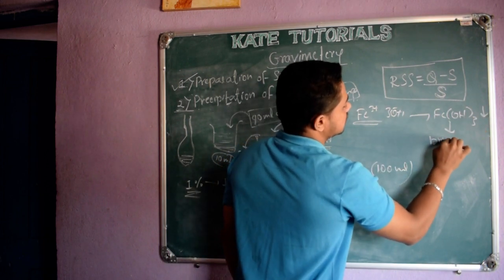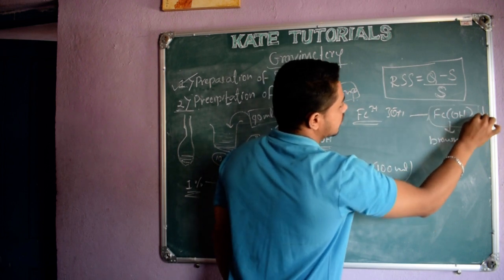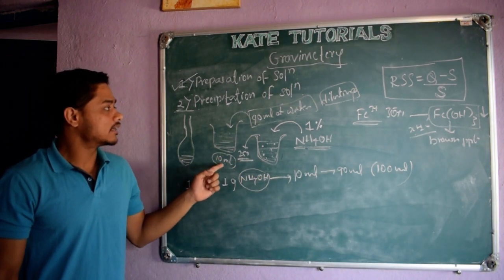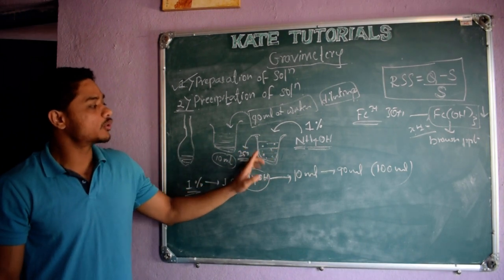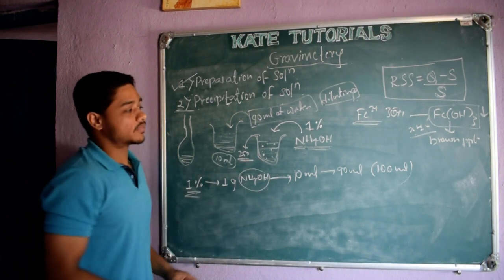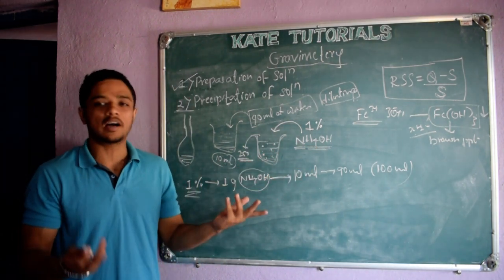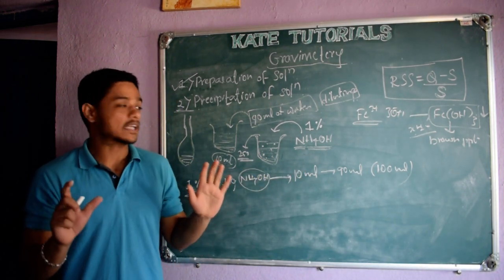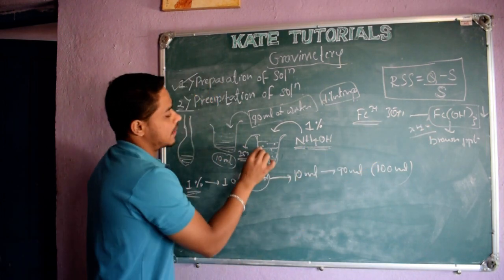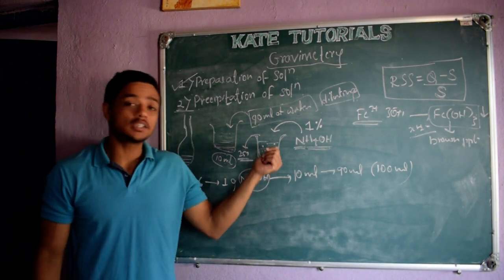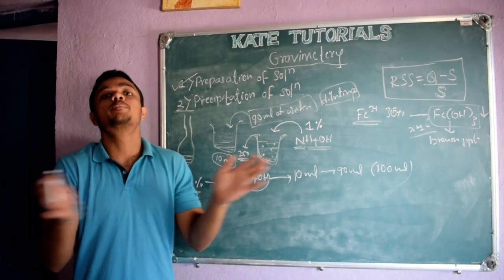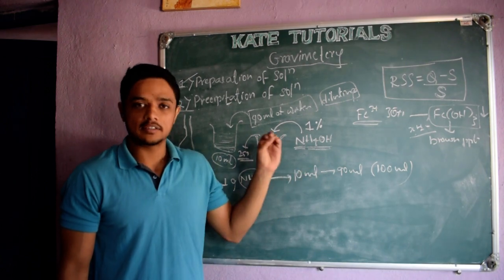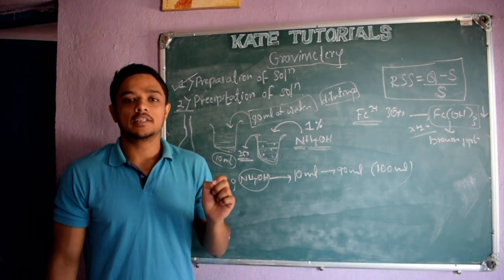And the color will be brown — the brown precipitate we will get. The precipitate is Fe(OH)₃·xH₂O. Its composition is not known exactly. So, I took the analyte, I diluted it — so that analyte should be distributed throughout the solution. If analyte is present only at the bottom and I add 1% ammonium hydroxide, it may precipitate haphazardly. But in this dilute solution, if I add dilute ammonium hydroxide, the precipitation will occur selectively — only Fe3+ will precipitate as Fe(OH)₃, and other molecules won't precipitate. If the solution is concentrated, then precipitation will be very fast, and some errors may occur. Here, no error. The precipitation should occur slowly so that the error will be less.